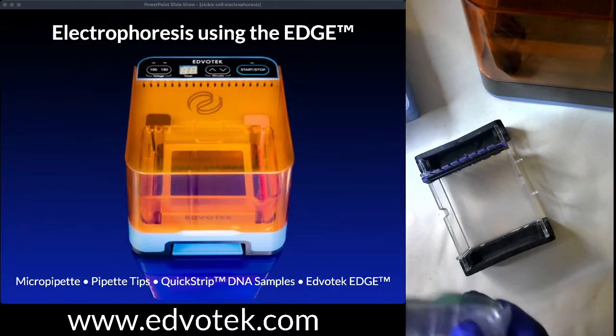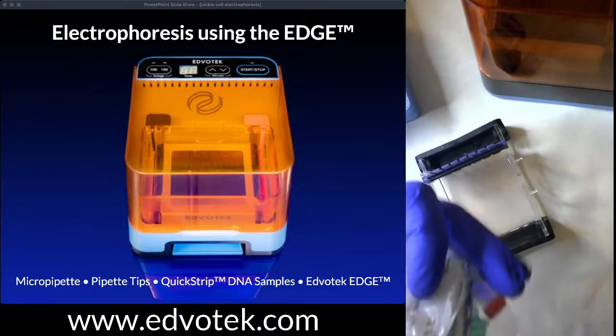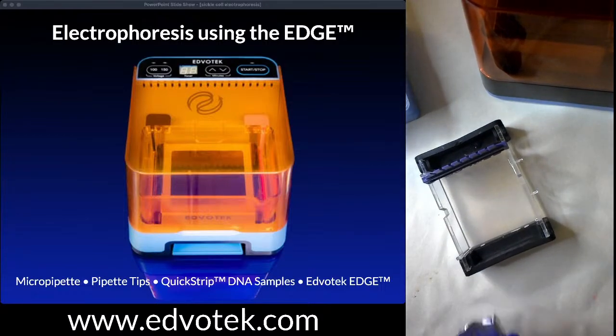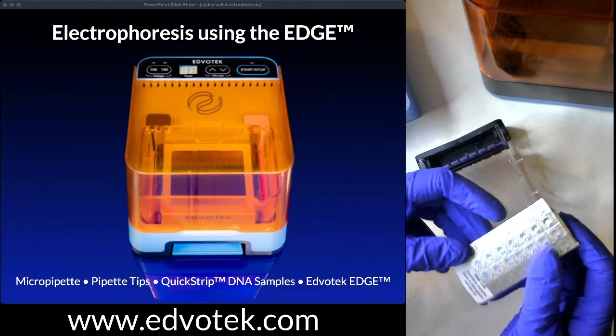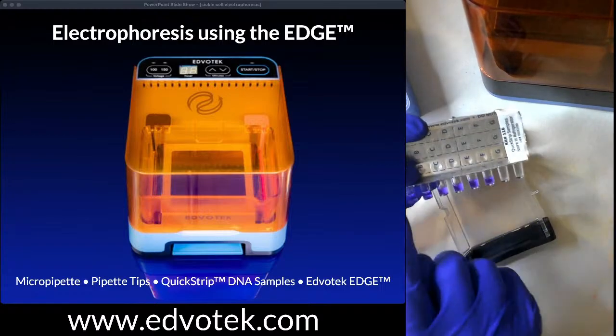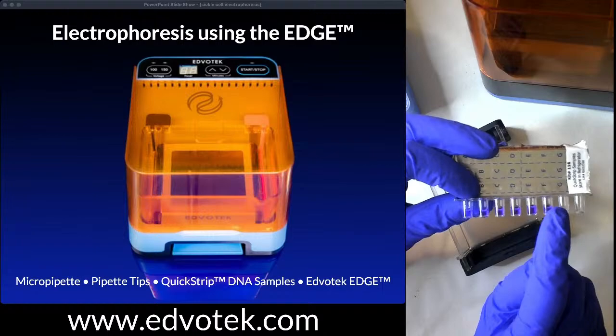This is our electrophoresis of sickle cell DNA. And so I'm going to pull out our quick strips. And quick strips are fantastic. They are pre-aliquoted samples. So basically everything you need to perform the experiment in terms of the DNA is already in the sample.